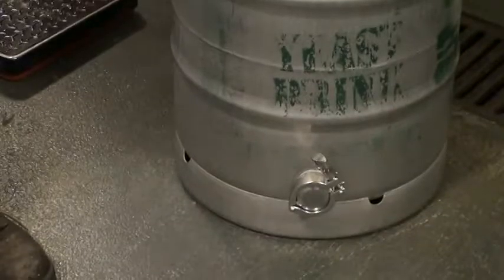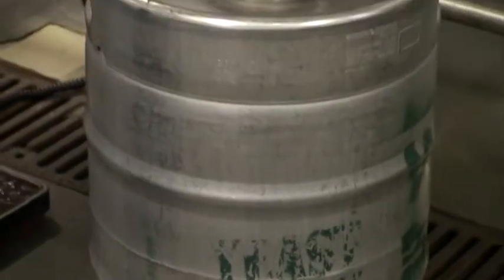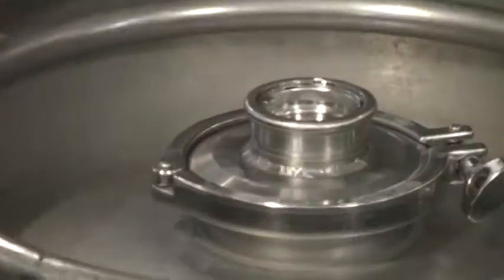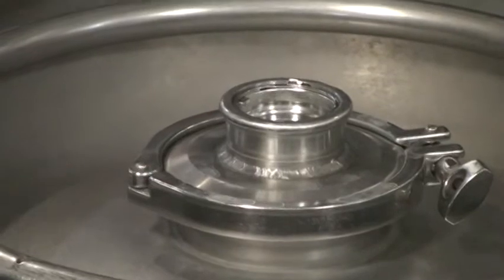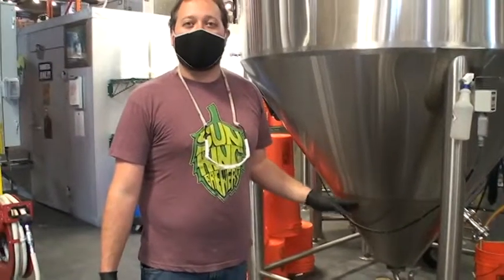4-inch top, 4.5-inch bottom. All of our brinks, after they're used, are opened up and rinsed out. They run through our Comac line twice, which will do a caustic cycle, acid cycle, and we'll steam sterilize them. Just be cautious. I always like looking inside to make sure we actually got everything out of there.